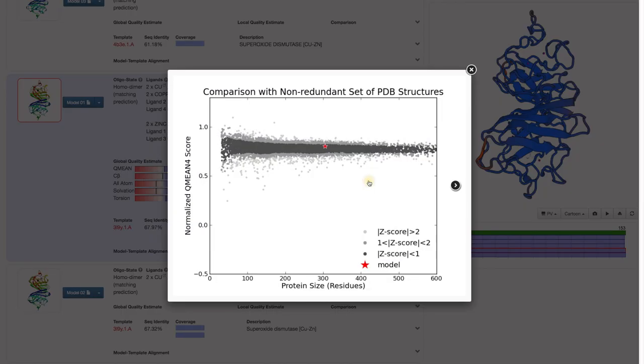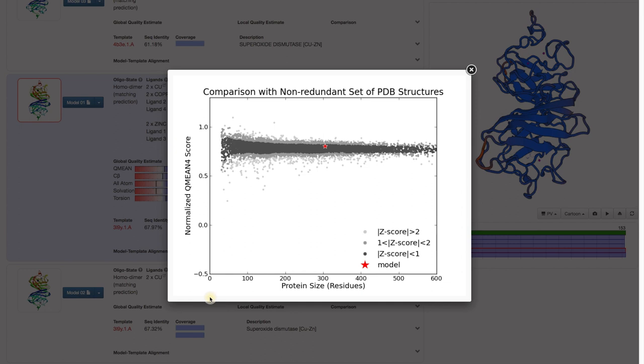So how can we estimate the quality of a model, or anything, if we don't know the answer? Well, we could describe some properties of known structures and then see how well these properties are represented in our model. And that is exactly what is shown here.